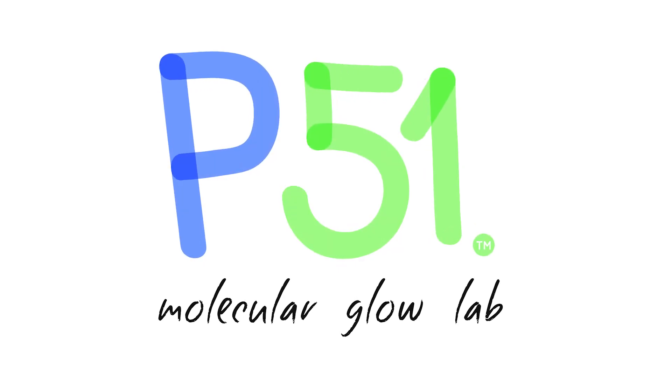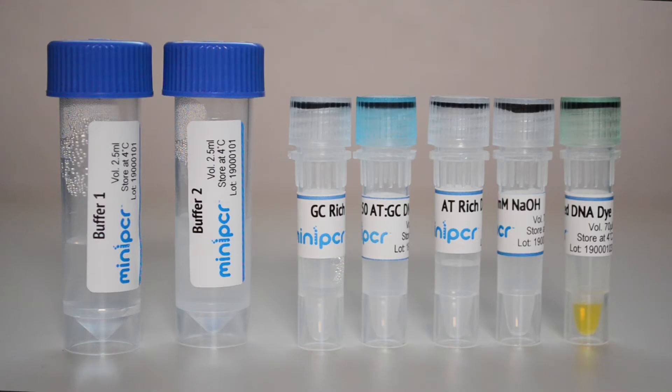Go beyond making models and experiment with DNA directly. I'm Dr. Alex Danis with Mini-PCR Bio, and I'm here to introduce you to the P51 DNA Glow Lab. With the P51 DNA Glow Lab, students get to interact with the structure of DNA in real time.